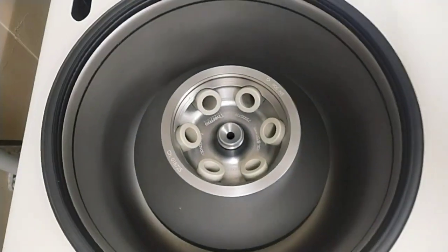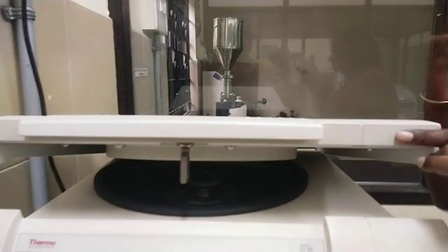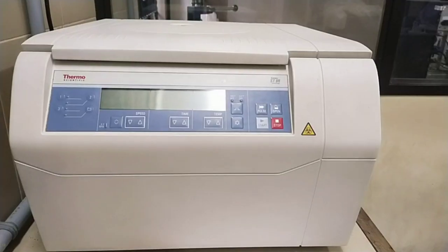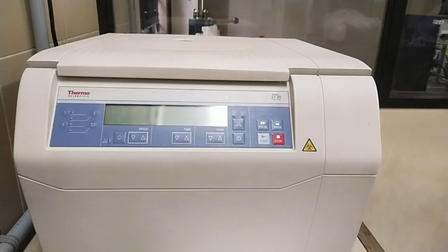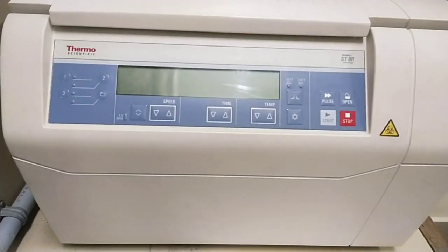Today you can observe the parts of the centrifuge and the separation of a sample. The instrument consists of a control panel, which contains the keys and displays readings of the centrifuge.